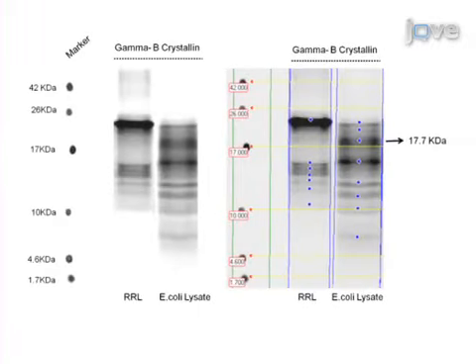Ultimately, results can be obtained that show nascent polypeptides of different lengths by Tris-tricine SDS-PAGE and autoradiography, thus indicating the presence of the pause sites along the mRNA of interest.